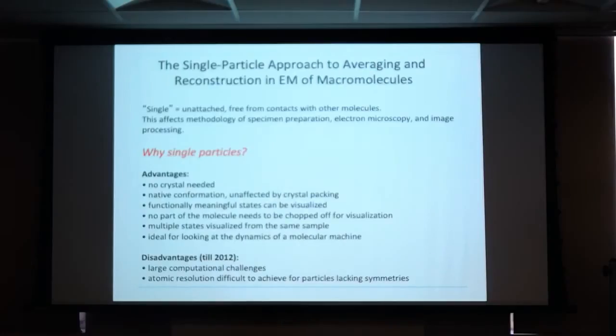So, single particle approach to averaging and reconstruction. You know, single means unattached, it doesn't mean one only, okay? And this whole data collection method affects the methodology of specimen preparation, electron microscopy, image processing. So everything sort of comes in one package, this entire methodology. So why single particles? Well, no crystals are needed. And we actually get the native conformation of molecules unaffected by crystal packing. And we get potentially functionally meaningful states that can be visualized. And no part of the molecules needs to be chopped off for visualization, as very often happens in X-ray crystallography. Multiple states can be visualized from the same sample. And it's ideal for looking at the dynamics of a molecular machine.